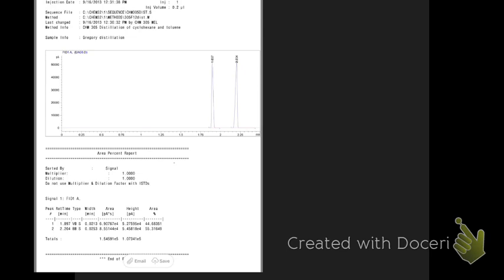If you look at the x-axis, the unit is minutes, and so that tells you that this x-axis is that retention time. And so the first peak hit the detector first, and so that means that it is the lower boiling point component. You should be able to figure out which is your lower boiling component from what you have in your lab information.